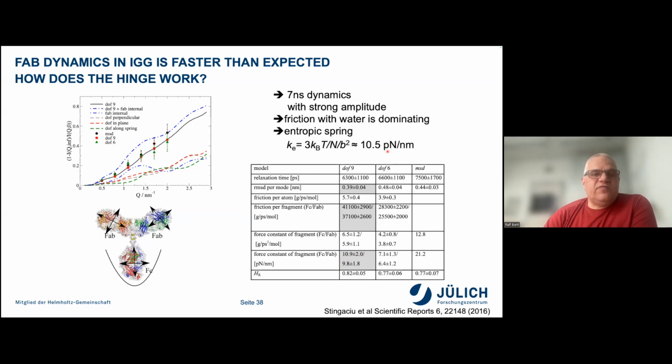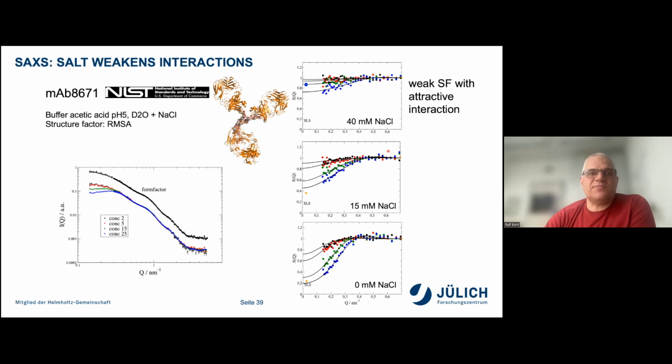At this point, from the long-time dynamics, we cannot access more, and it was always after these measurements that we had the dream to get monoclonal antibodies. That was then possible with LINXS. Especially because we got our antibodies from NIST, and that is a very nice system. It's very stable, and we got large amounts so that we can make really good experiments.